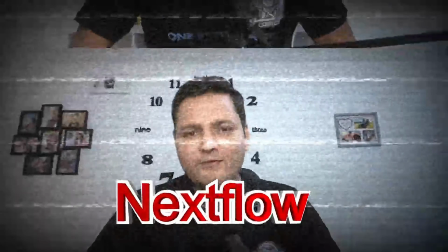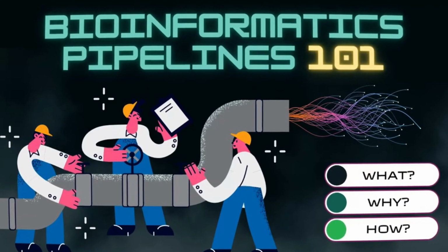You probably heard about the phrase Nextflow among the bioinformaticians in your group. And you probably heard about different bioinformatics pipelines in your group. How to manage those pipelines effectively is quite challenging among the bioinformaticians and also among the biotechnologists, those who want to delve into bioinformatics pipelines.